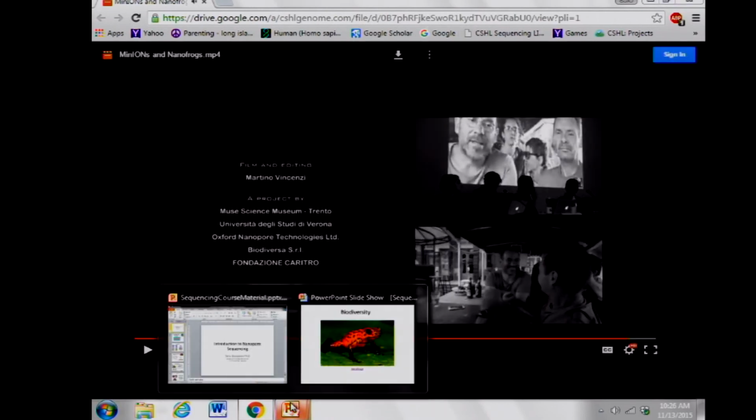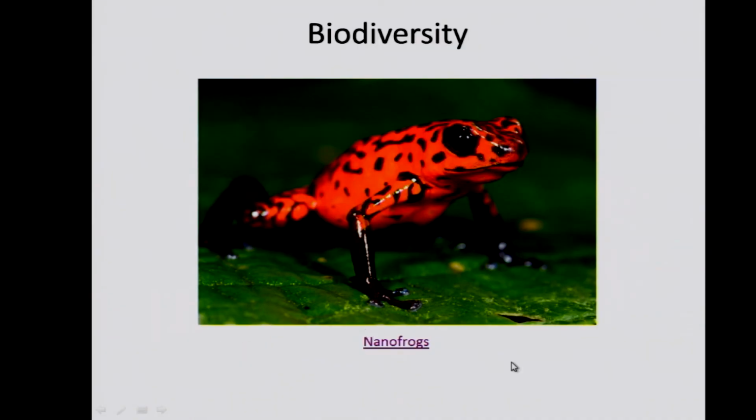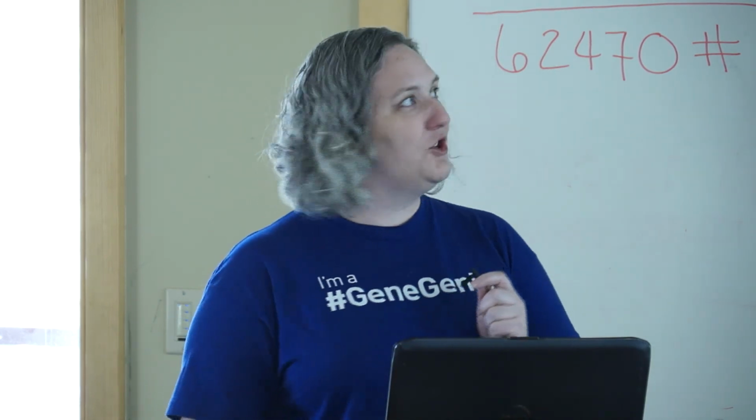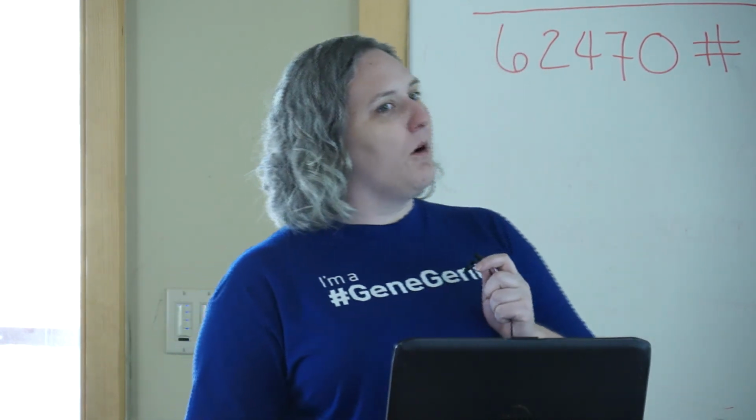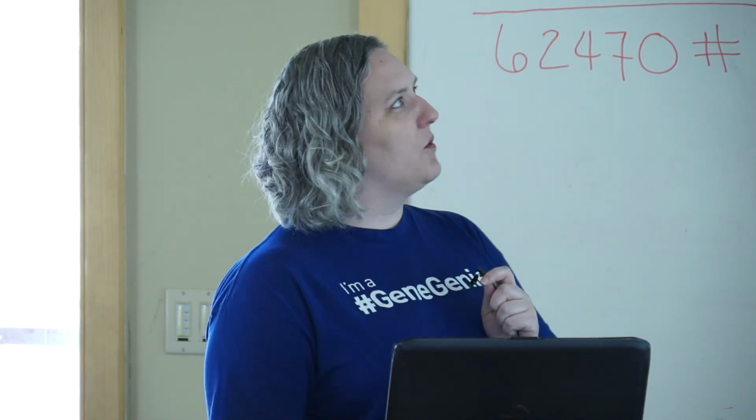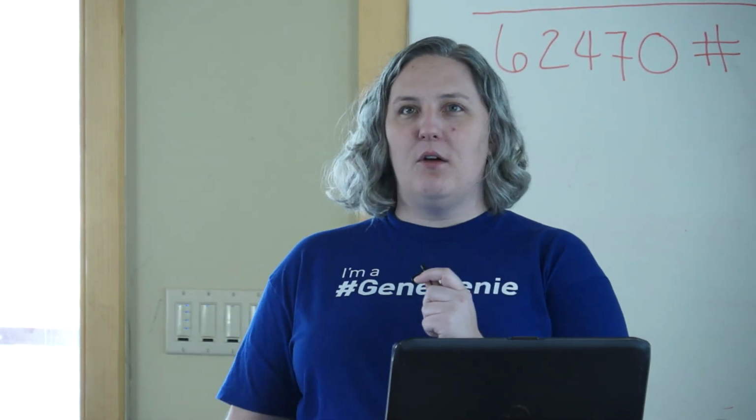All right, so that was Massimo Delledonne and his work on biodiversity. Like the problem with getting Ebola samples out of Africa, it's also very difficult to get nanofrogs and other unusual, strange, and interesting organisms out of their local areas, which again is a very good thing. But we can bring the sequencers to them, and as you can see, they were sequencing in the middle of the jungle, which was quite unusual, and I don't think anyone's been able to accomplish that significantly before. I believe there was sequencing at sea that Ion Torrent did, but I'm not sure about sequencing in the jungle. All right, and I'm going to show one more little short video in the interest of time.